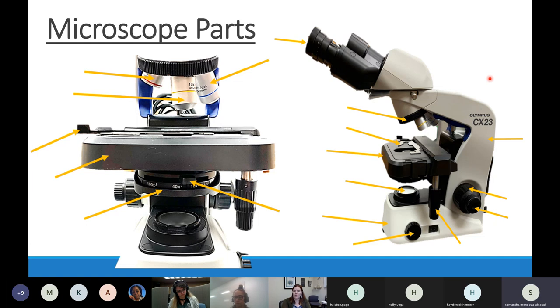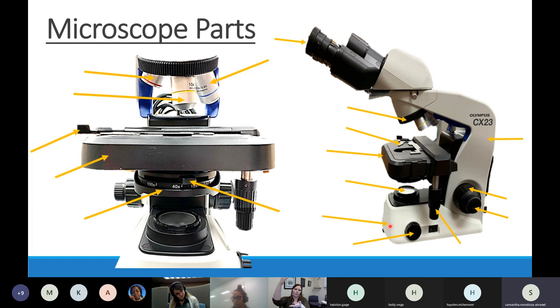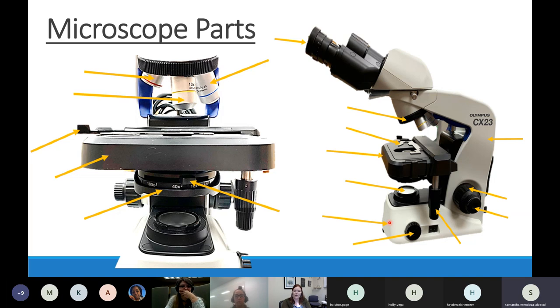When looking at a microscope, the first parts you'll interact with are this tall part called the arm of the microscope, and this flat part at the bottom called the base. When we first go into the lab, we will always transport the microscope using two hands - one underneath the base, one holding onto the arm. The first part you'll look through is up here at the top - these are called the ocular lenses. By themselves, the ocular lenses make things 10 times bigger.